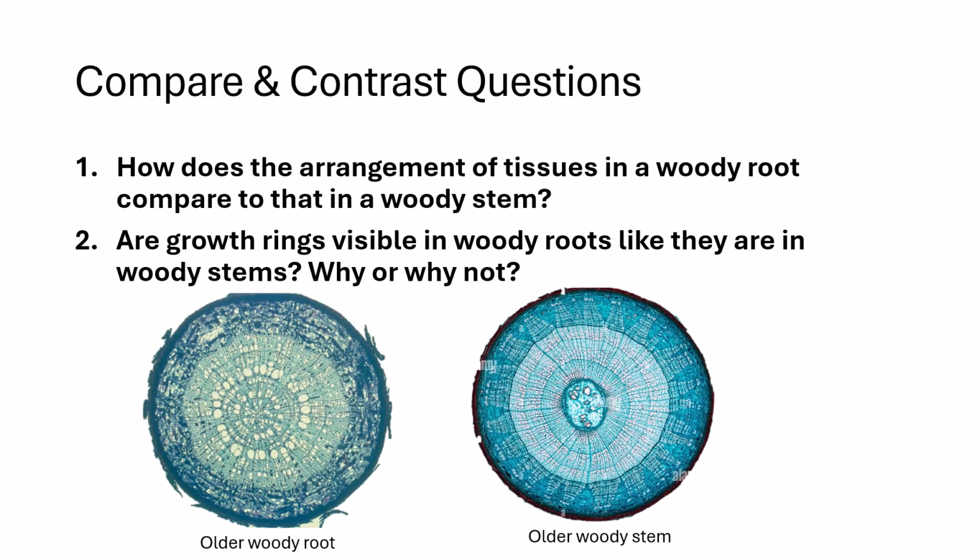Since it looks like the woody root we looked at was younger, I found a slide of an older basswood root.